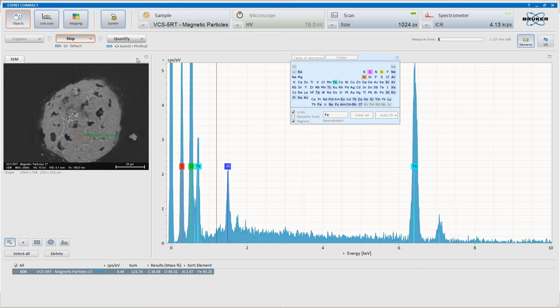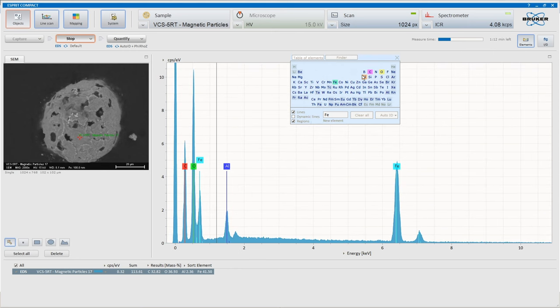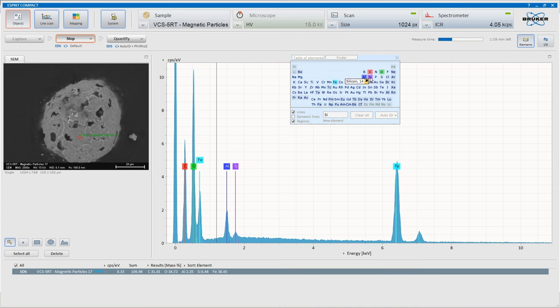Well, there we go. Iron and aluminium in this case. Interesting. This is unusual. Slightly different from the norm. Clear aluminium peak there, and silicon too. Very unusual, this one. Has that significant amount of aluminium in it.